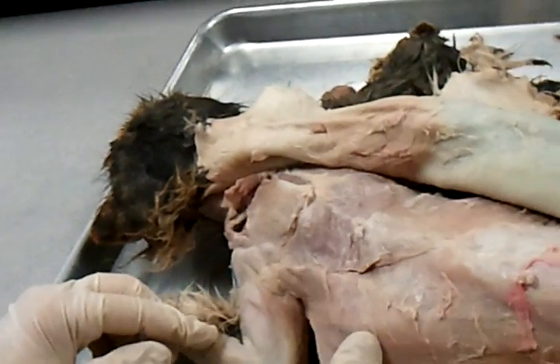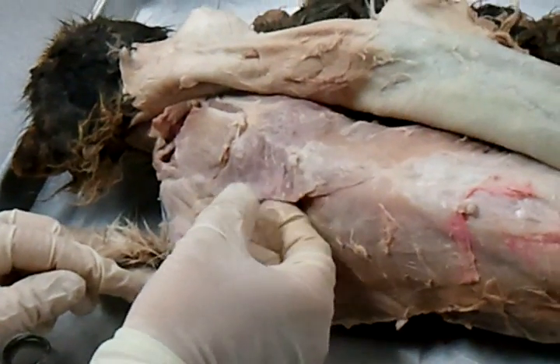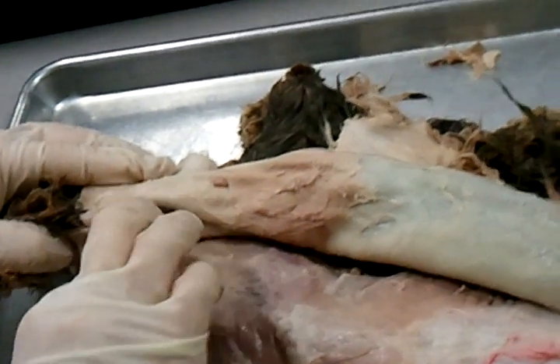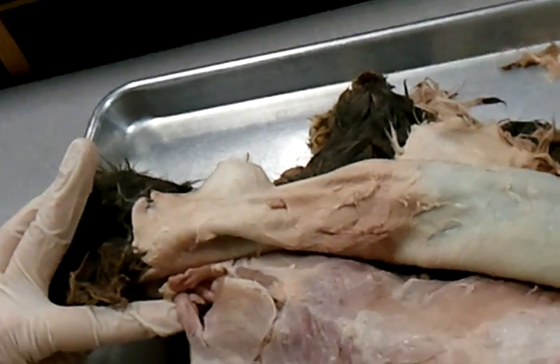Let's go over it again. Latissimus dorsi, spino trapezius, acromeo trapezius, clavo trapezius, and what was this one? Levator scapulae ventralis.